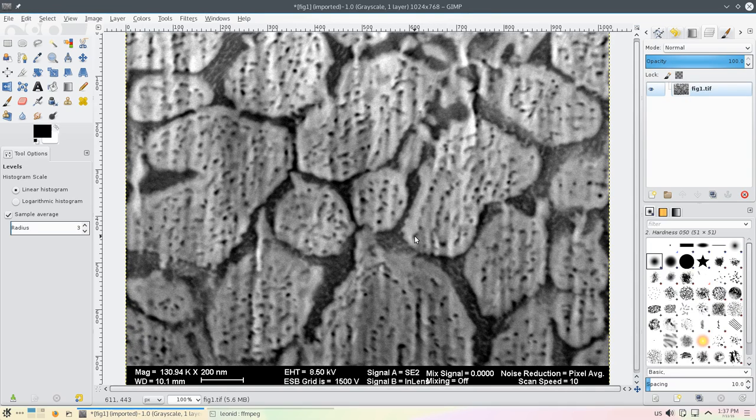So you can see this is the original image. Now we did the stretching, and now we did the unsharp mask. Let me show it again. Original, stretching, unsharp mask. So we can see that the quality is improved quite a lot. Let me go to the full display.